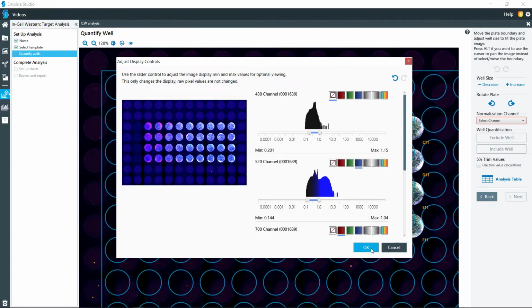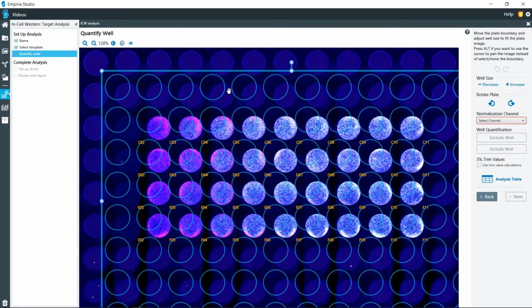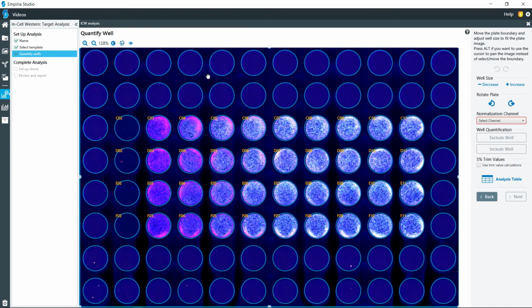see. Now, one important thing to note about this experiment. In this experiment, we have used the cell tag 520, and this was imaged on the Odyssey M. The process will be very similar for the CLX. You'll have the cell tag in the 700 channel and your target in the 800. But for this particular one, I'm going to choose the cell tag 520. If you are using the CLX, you would just choose the cell tag for the 700. But with this, we're able to get the normalization and 2 targets out of 1 image.